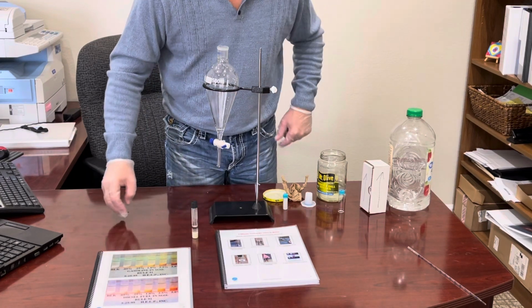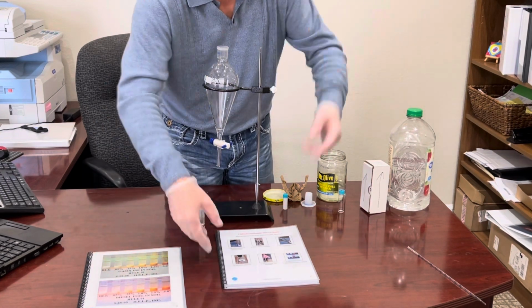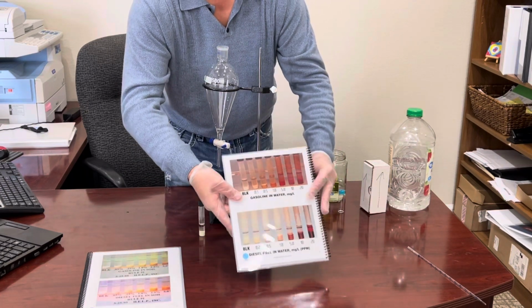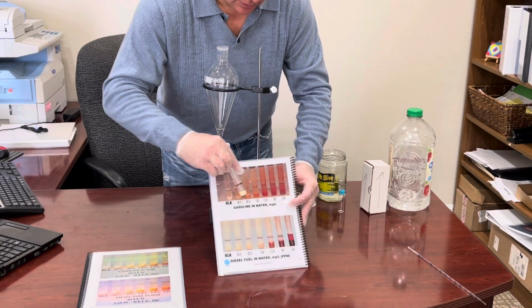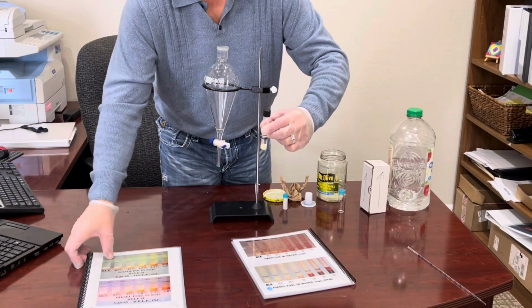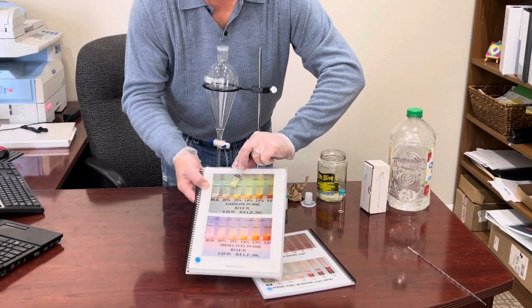Now, we are using what is called our high range extract solvent, which we typically use in soil. So we're not using our typical extract solvent for water, so we don't want to use our water calibration. Since we use our extract solvent that we use in soil, we want to use our high range calibration.